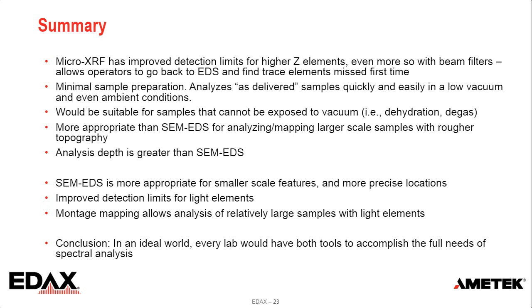Next question, will the X-ray source be possible to change with different source for different energy? Yes, it is possible. You can use different X-ray tube materials and operate the instrument at different energies.